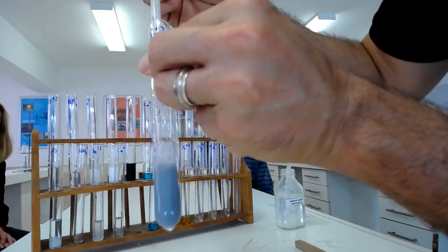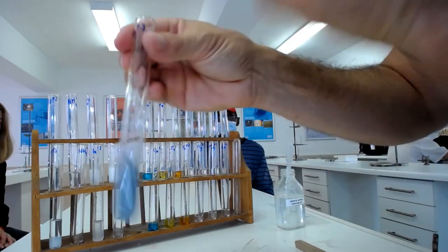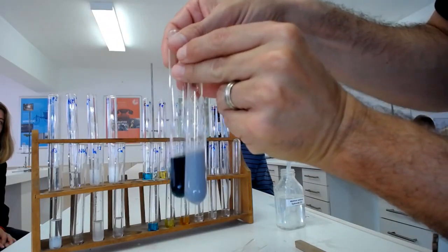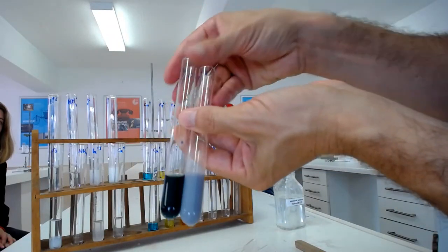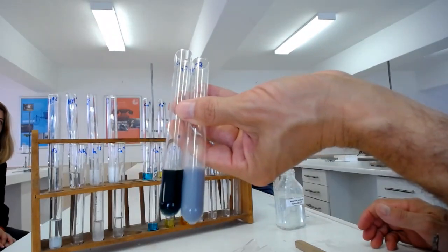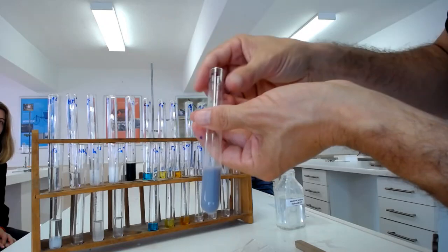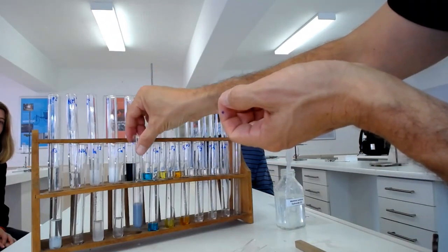Oh, insoluble. Sorry, that was missed. So you can see definitely that the color remains, the precipitate remains, while the other one is in liquid. Nice. I like it when things work. Barium, you bugger. Right, okay, let's look at copper.